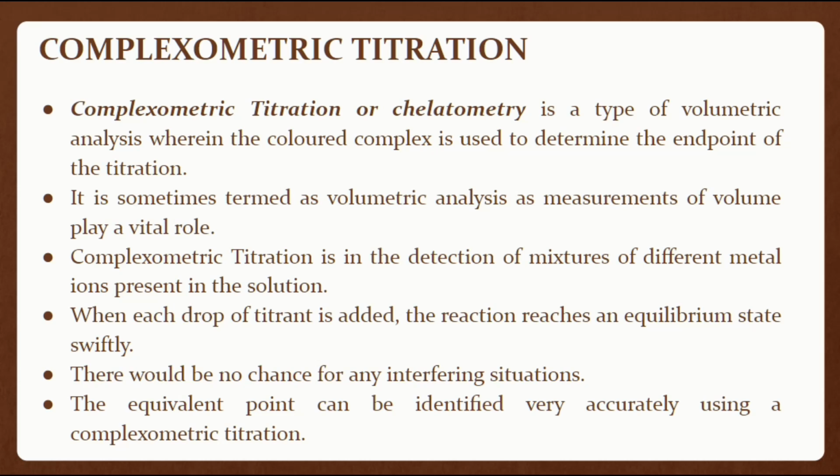There would be no chance for any interfering situations. The equivalence point can be identified very accurately using a complexometric titration. EDTA is a commonly used titrant. Primary standards for this kind of titration include pure metals such as zinc, magnesium, and manganese and their salts.